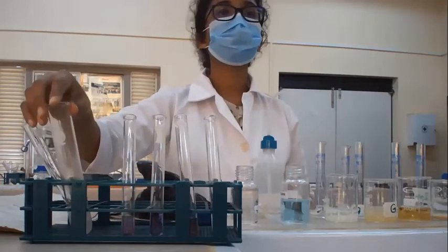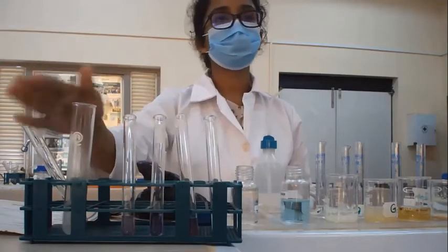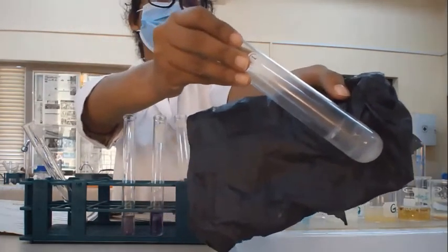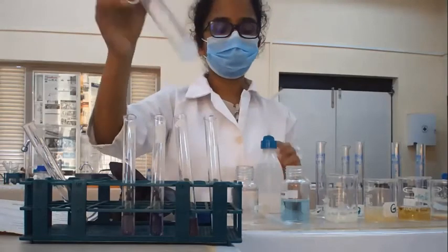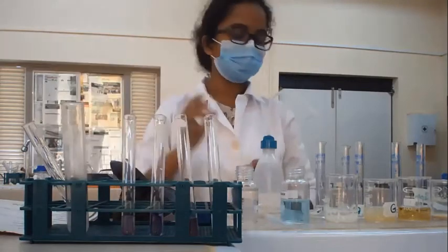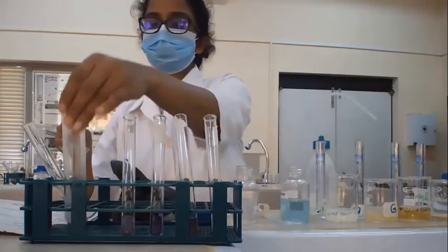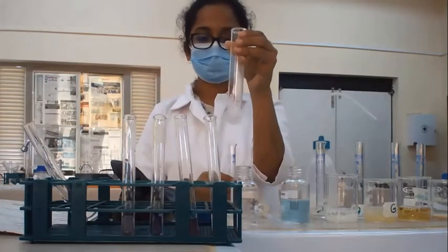After heating the urea in the Bunsen burner, we have let it cool for a few minutes. And after cooling, you may see the sample got solidified. Then, I told you this residue is the biuret. And for this, we are going to add 2 milliliters of distilled water, and we are going to shake it well.